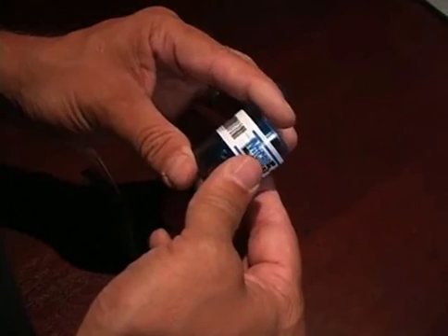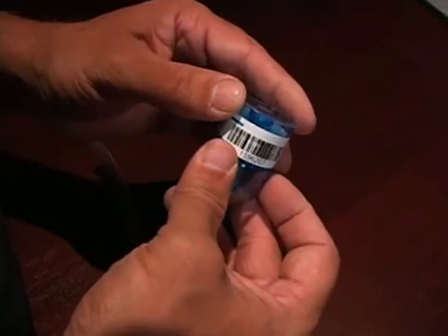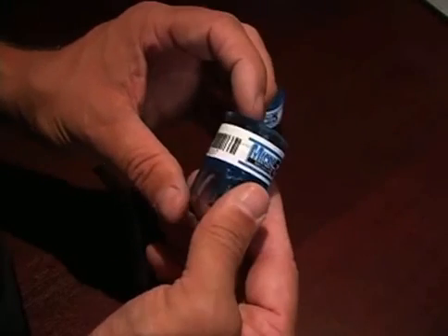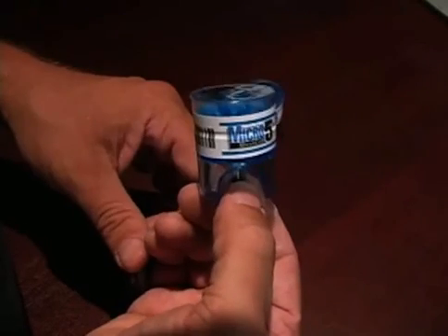And in the meantime, you have to store it in a temperature range of 50 to 80 degrees. No cooler. Do not use this. Do not sample with this device when the air temperature is below 32 degrees Fahrenheit. And that's the Micro 5.